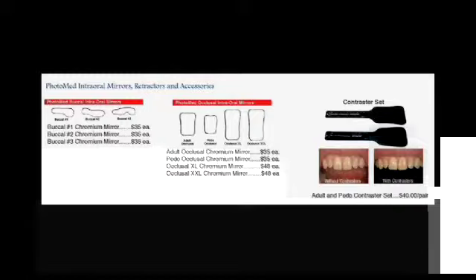These are glass mirrors. They need to be stored and cared for properly, because they do scratch very easily, and there's nothing more annoying than having a scratch in your image, especially if you're looking at publishing or presenting. I never like to see scratches in there.